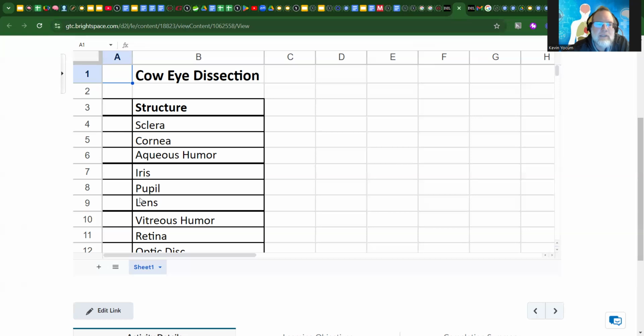And then the lens is going to be a pretty thick, clear, yellowy orange. All of your lenses will be a little bit different, but for the most part, they're kind of cloudy, and they're like a giant, clear, kind of yellowish, cloudy Skittle. That's what the lenses look like. So we'll pop those babies out.